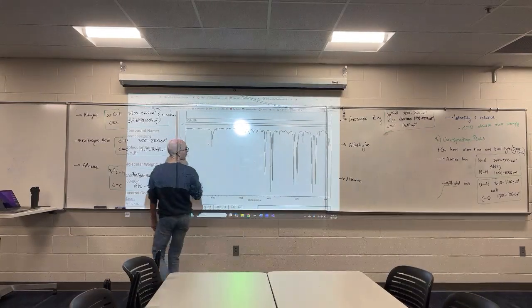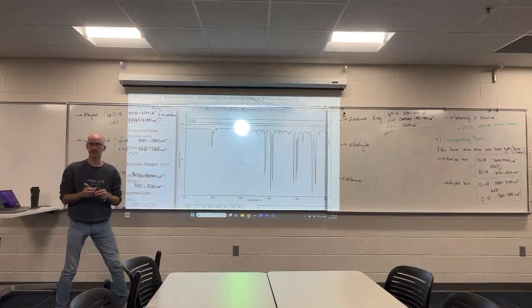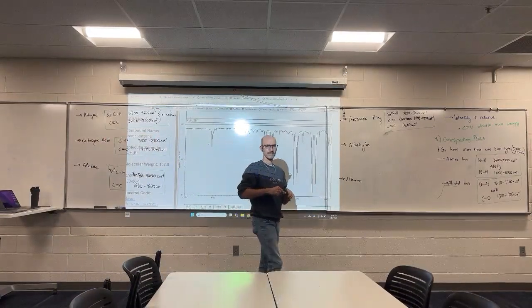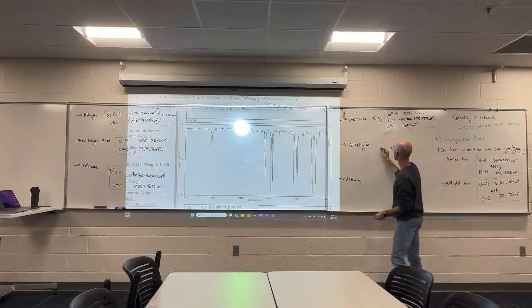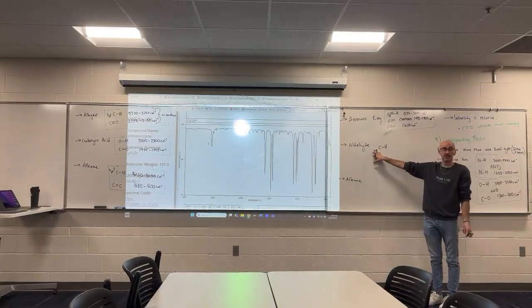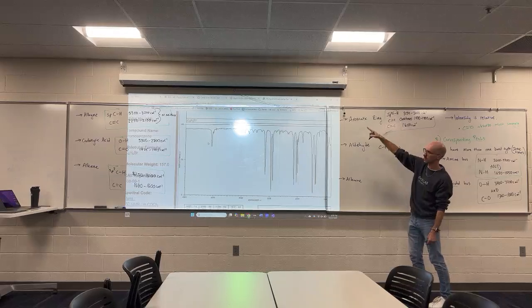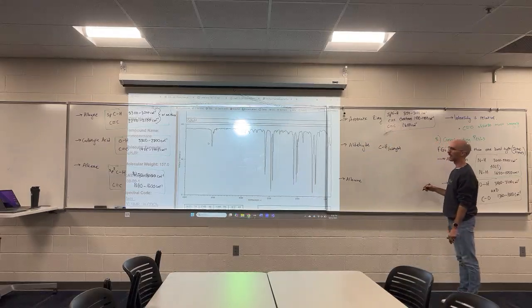All right, we're in our last couple, the aldehyde. What do we have here? Good, the CH. Now technically that is the CH, it's sp2, but we're going to call it CH aldehyde because it's distinct from the sp2CH's of the alkene and the aromatic ring.